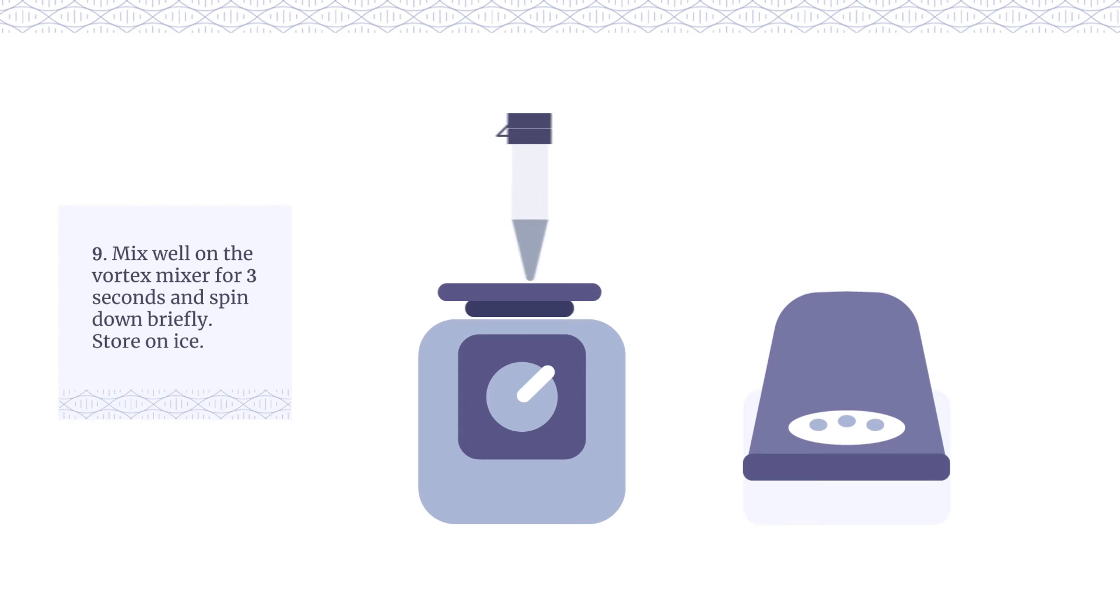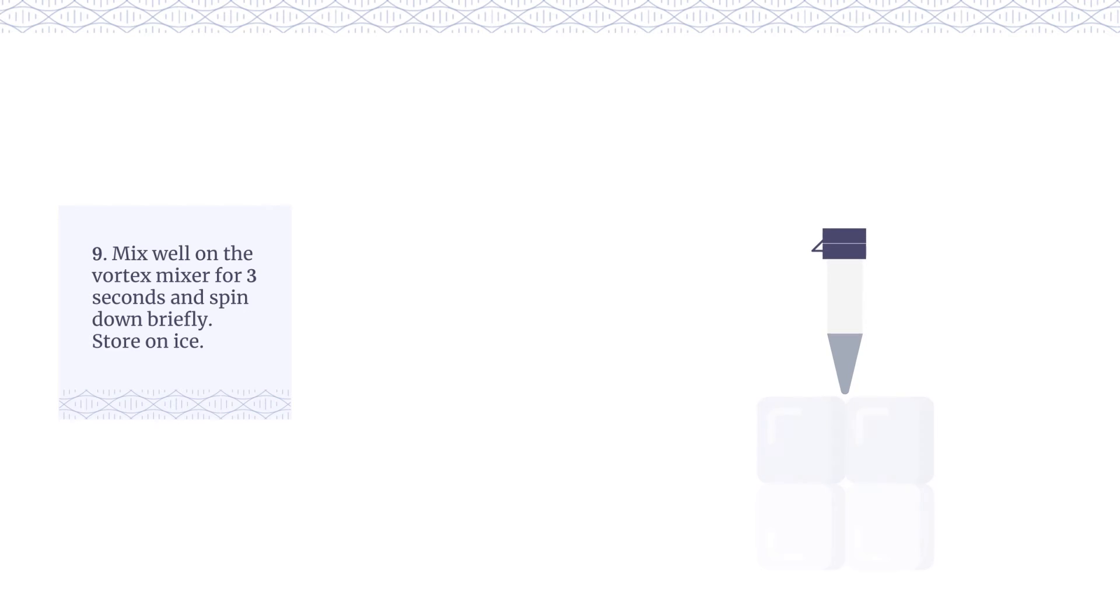Mix well on the vortex mixer for 3 seconds and spin down briefly. Store on ice.